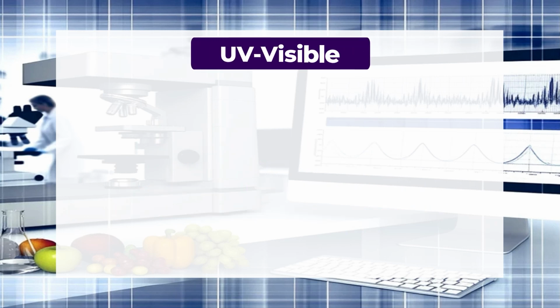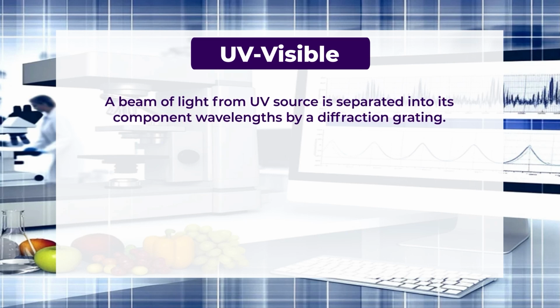In UV visible, we have a beam of light from a UV source. We have seen in the electromagnetic spectrum that there are radiations of various wavelengths. In UV visible, the wavelengths which fall in the ultraviolet region from the source are the ones which are used. So a beam of light from the source separates into its component wavelengths, for example 200 nanometer to 800 nanometer. A source may radiate 200 to 800, or 400 to 800, or 500 to 800, depending on what kind of source we are using.